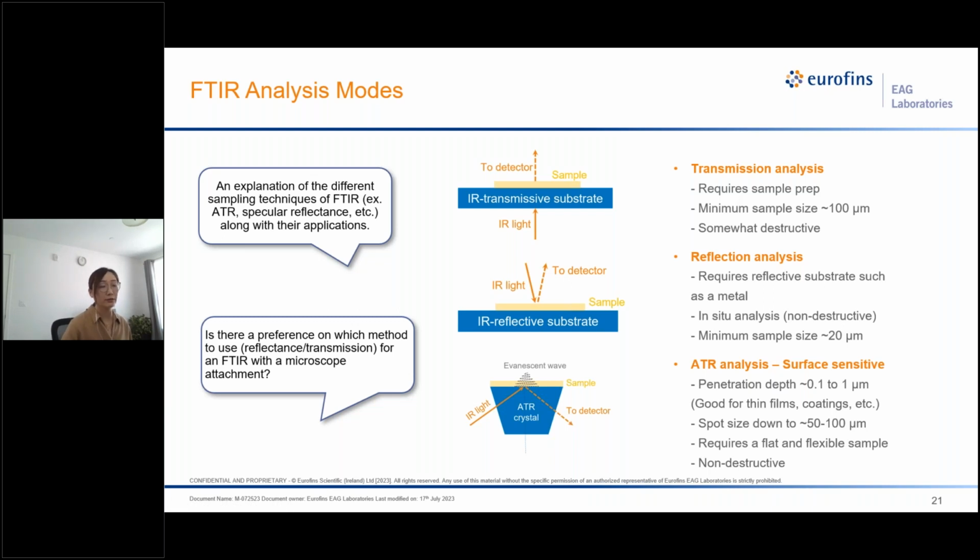So when given a certain type of sample, we really need to take into consideration such things as the purpose of the analysis, the geometry, the size, or even the texture of the sample in order to choose the most appropriate analysis mode to characterize it.